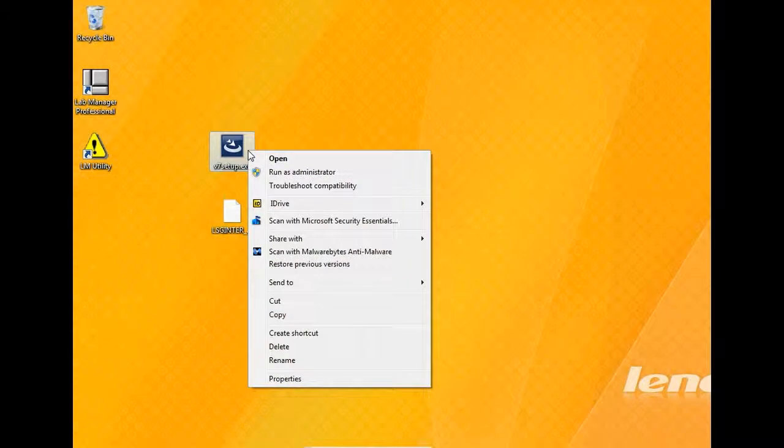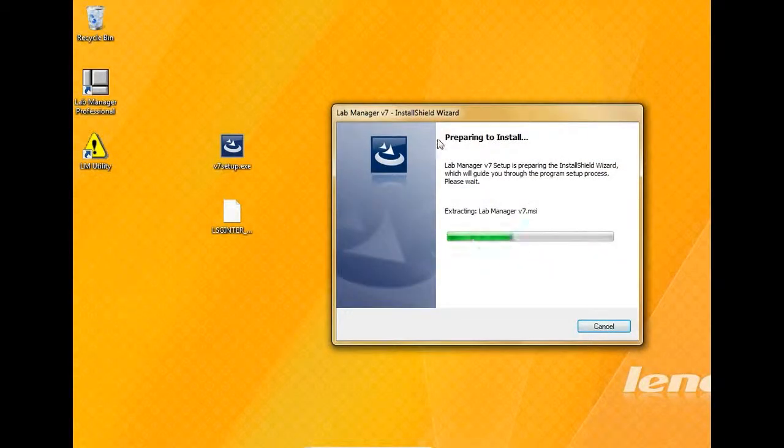So we're going to install on a workstation, so we're going to right-click on the file. Now, the file could be called something else if you download it off our website, but if you right-click on it, run as administrator, you may have a question that pops up for user account controls, and that will be either on Windows 7 or Windows 8. And if you do, just say allow or accept, and then it should go through that. Other operating systems might not actually say those. I happen to have my user account controls turned off, and so it didn't pop up that message.